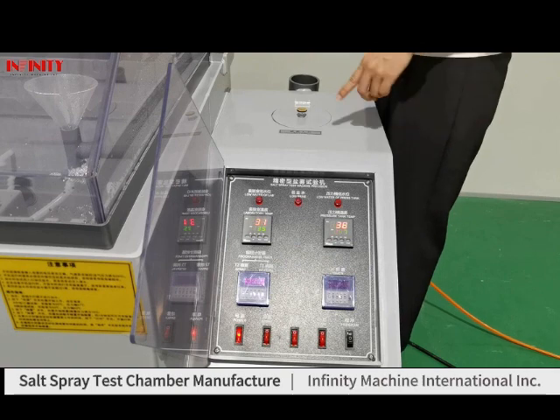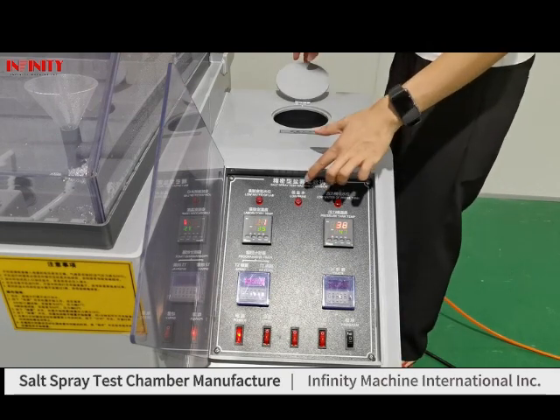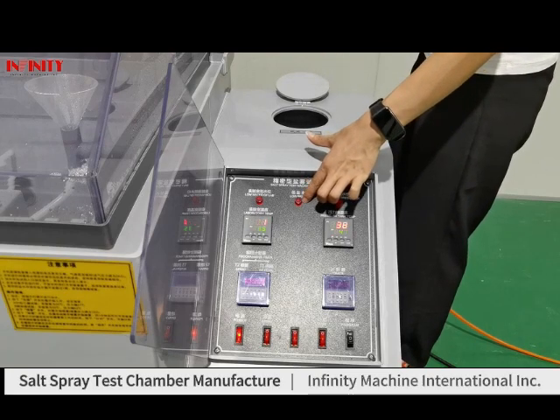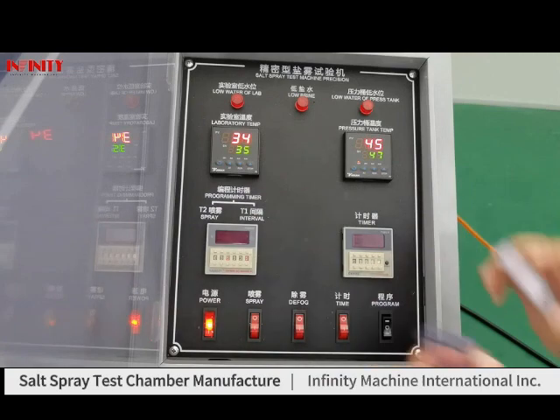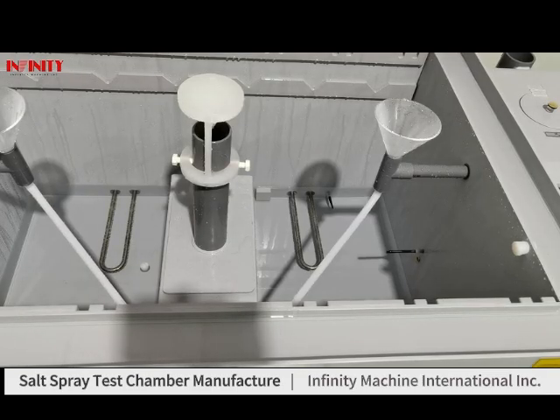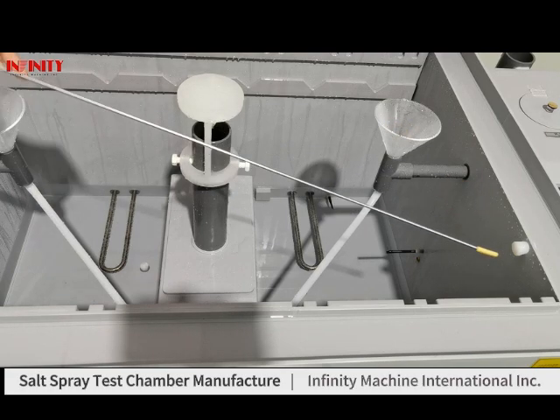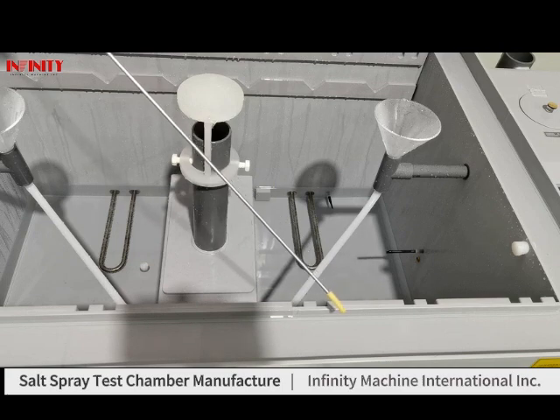Our engineer has already added enough water to the brine tank, so the low water indicator has turned off. For setting parameters, please remove these covers. After finishing the test, if you don't have a plan to use the machine recently, please remove this part and this part to dry away the water from the brine tank and the chamber.